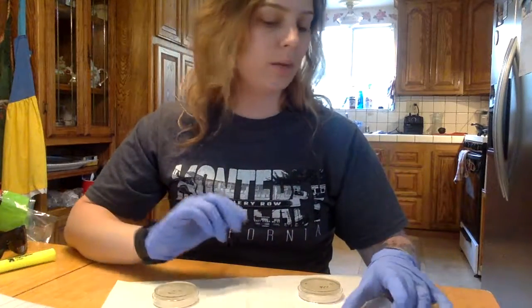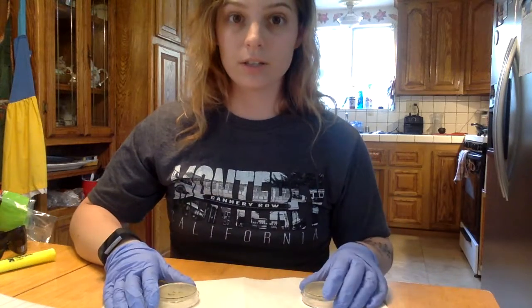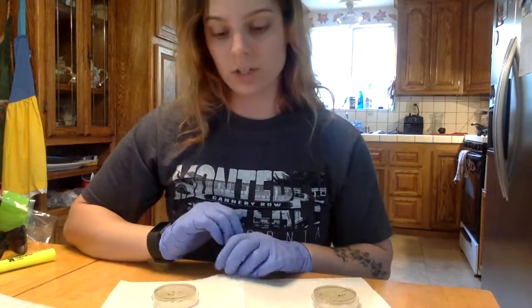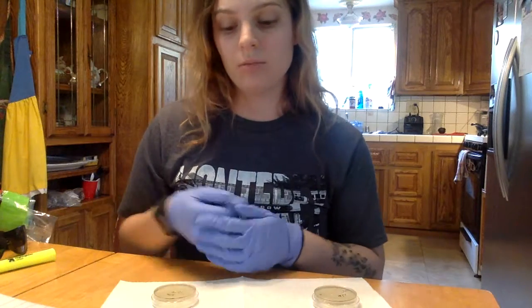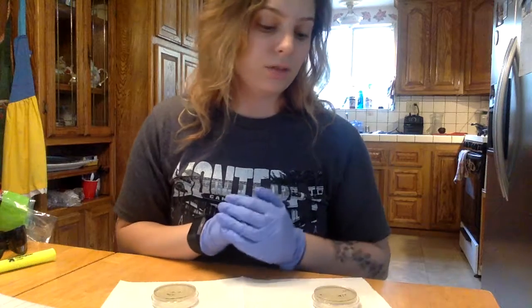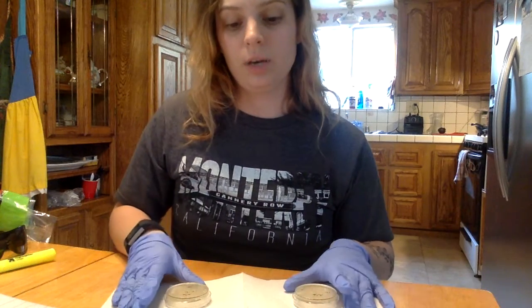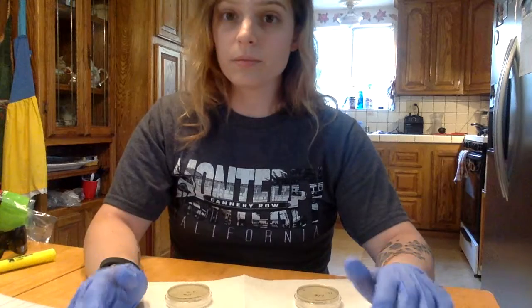So I'm not very happy with the outcome of the poor growth, and there could be different things that were involved. On the first one, there was some fungal contamination, so it could have been a process of the inoculation loop had gotten contaminated and I mixed it onto the first one. It could be a number of different things. It could also be that we are struggling with heat over in our house right now, so we do not have perfect temperature for the incubation.